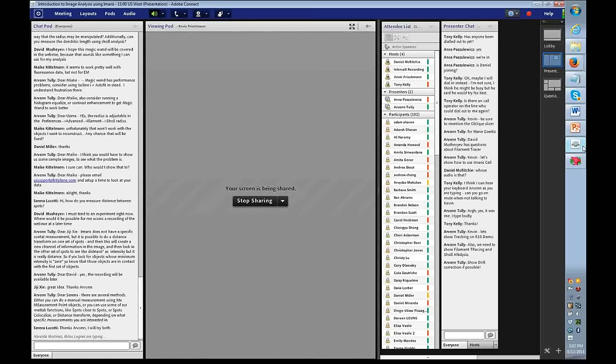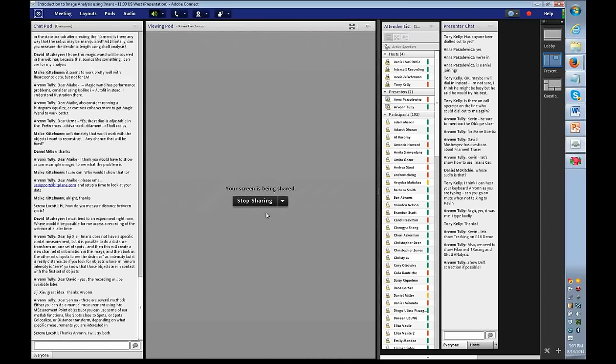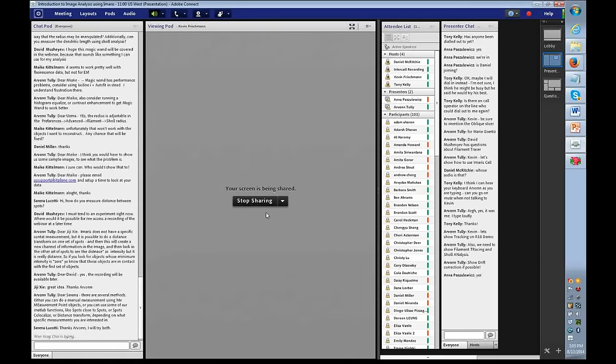What else do we have? You want to show one, Arvonn? Well, I've got a couple questions about distance transform. So do you think we should do a distance transform demo? Sure. Popular feature. Also have some filament tracers. So maybe try to think if I have any good filament tracer measurements.